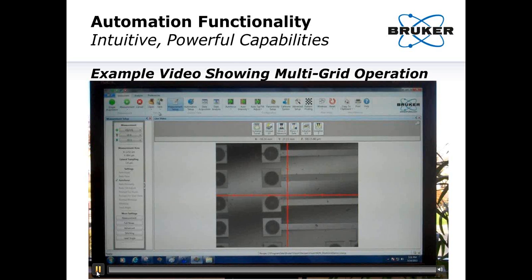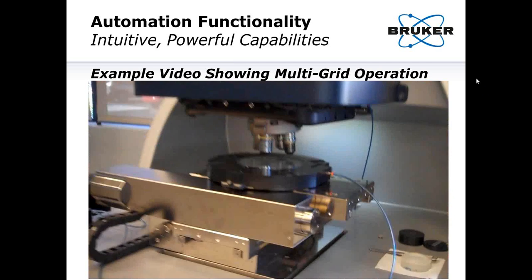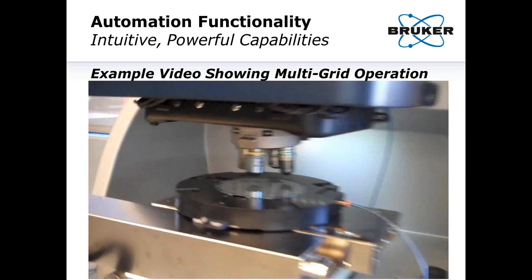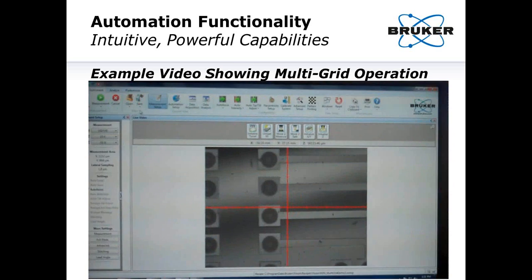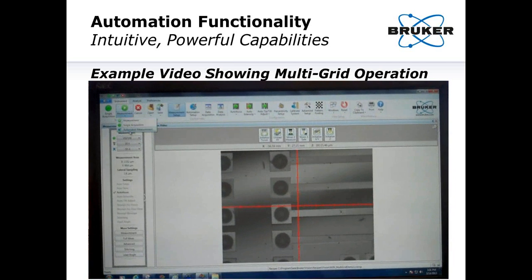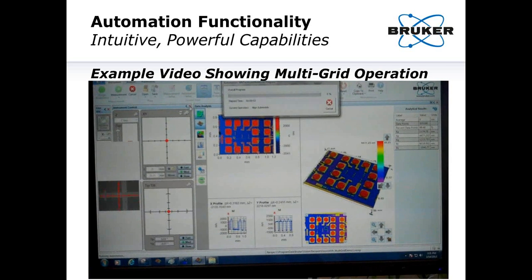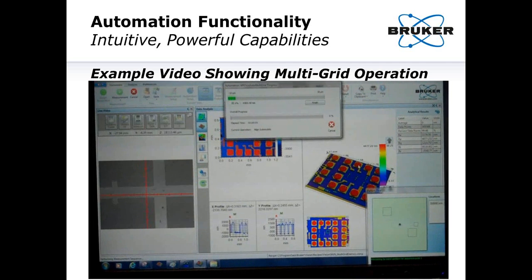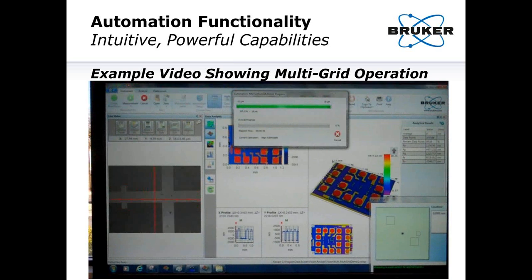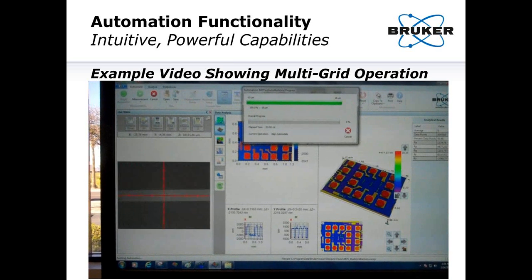So looking at our ContourX platform with a wafer loaded onto a wafer vacuum chuck, and there are several different die on this wafer, different electronic devices on the sample itself. And what I'm doing now is running an automation. You can see the video at the left, that first pattern. You're doing an alignment at one point, which is in the center, and finding the pattern. It's making a measurement, and then you'll see it shift that pattern to the center for alignment.